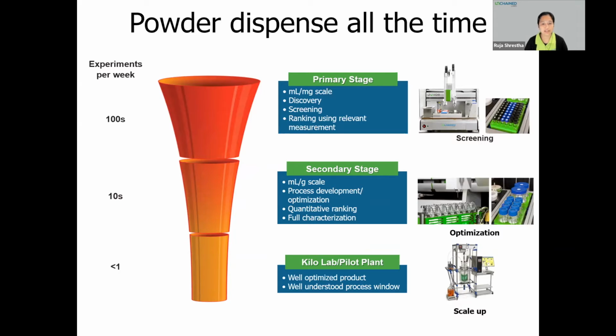But it is mostly painful in the early stages when you have so many powders to dispense into so many different containers, handle different amounts, and keep track of all of them. And you have a whole lot more things to consider when running an experiment.